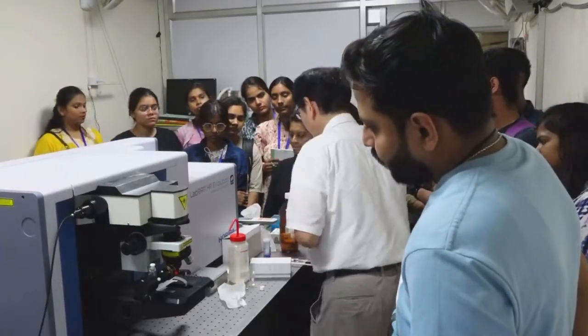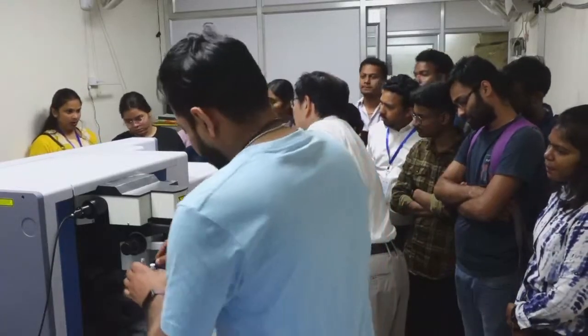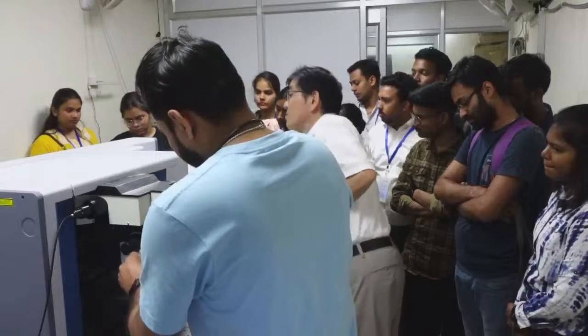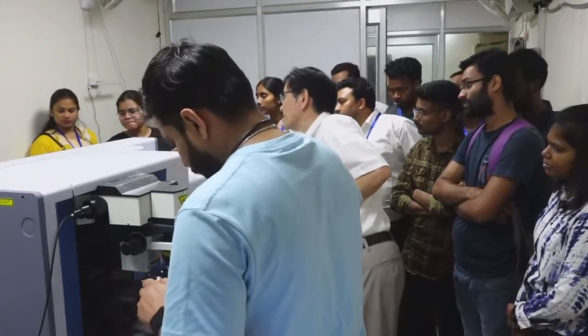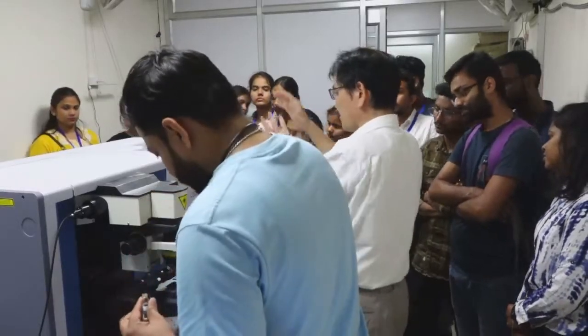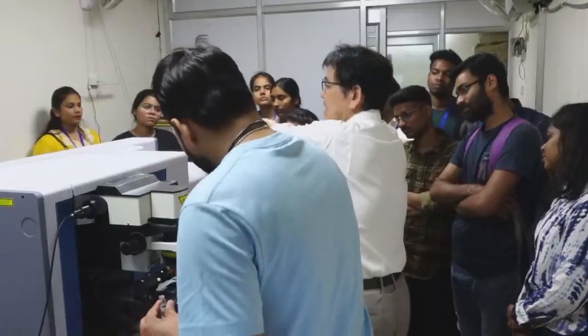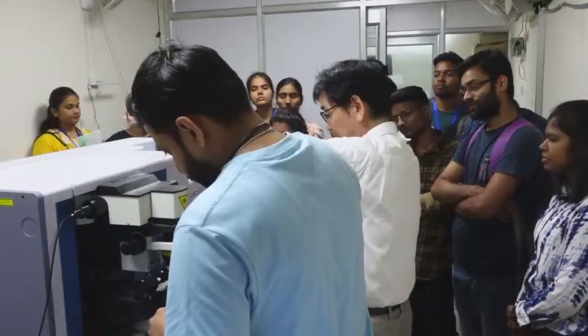So for safety, the laser beam goes through the optical fiber and is introduced into this equipment. Probably you see over there. The laser beam comes into this box, and the sample point is here.